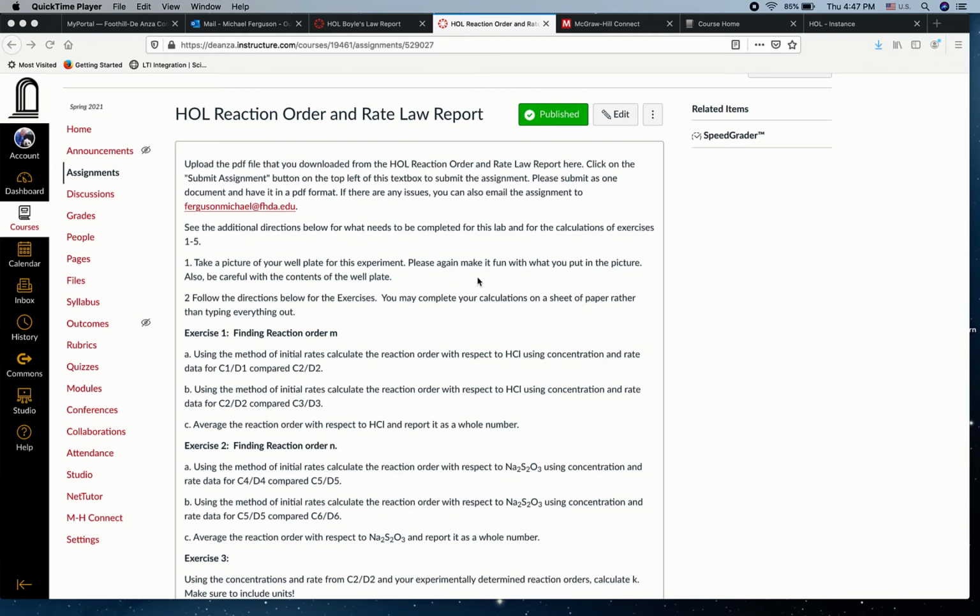This one's getting a little more dangerous, so be sure to wear your gloves and goggles with glasses, I should say, with this one. It's mostly for the hydrochloric acid, and you don't want to touch the sodium thiosulfate either.